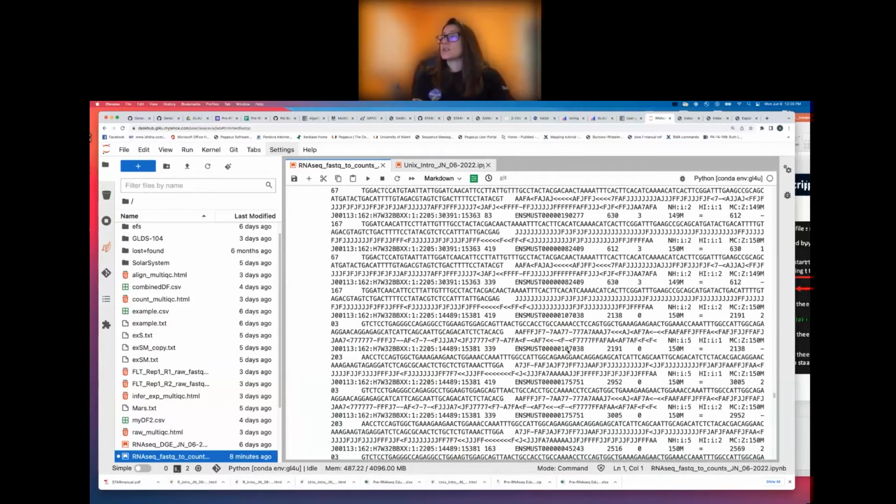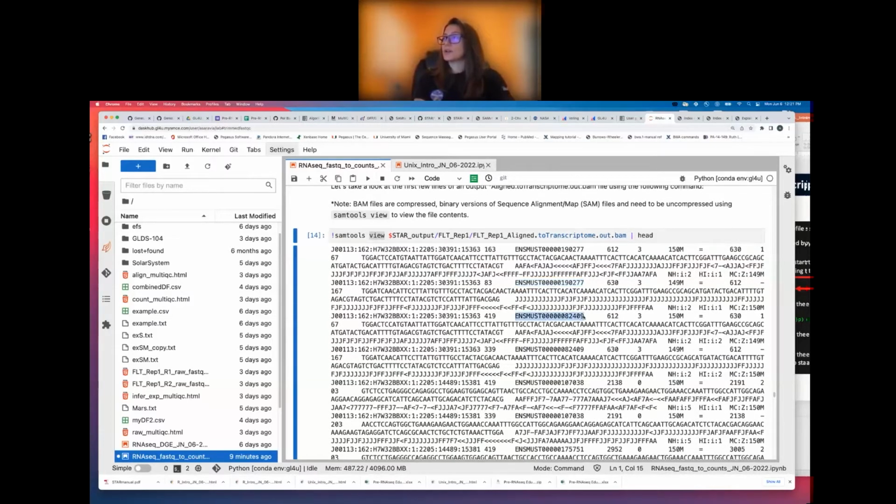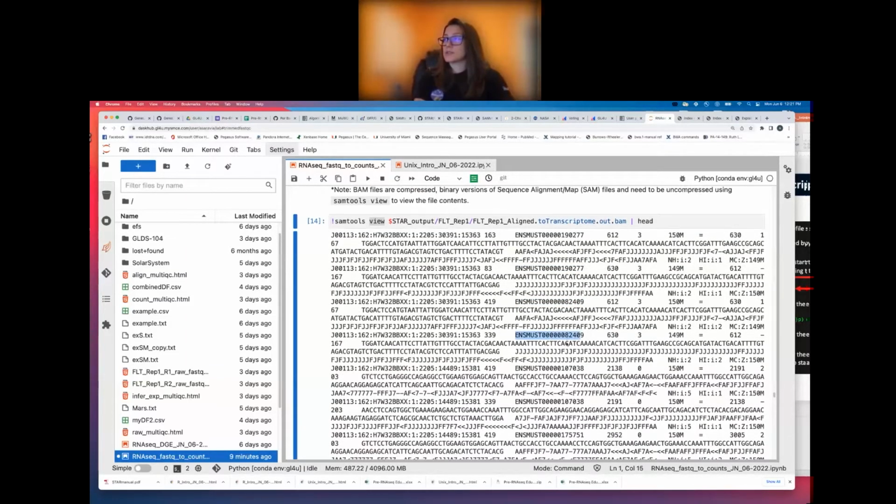And so just like some of you mentioned in your answers, we're going to go through this third column and look. I think I can highlight more than one thing. No, we're going to look at every single ID here. So that and that is the same. So far we just have 1. This is different than that. So now we have 2. This is the same as the one above it. So still just 2. This is different than the 2 above it. So now we're up to 3. This is the same as the one above it.